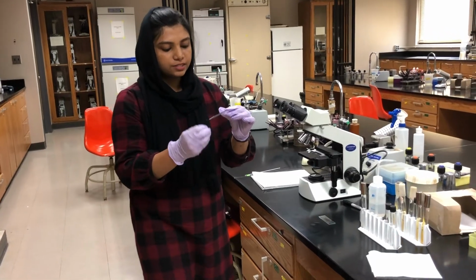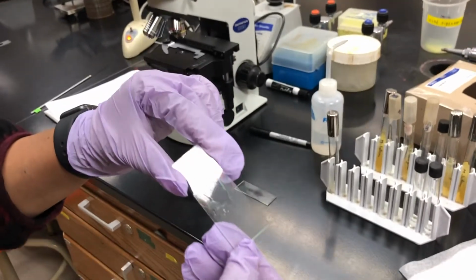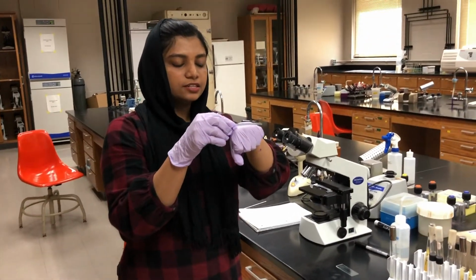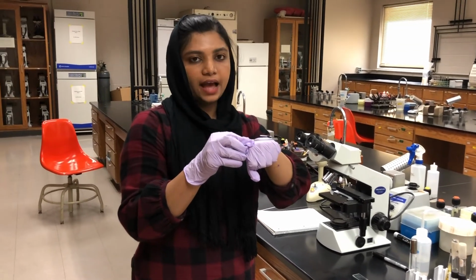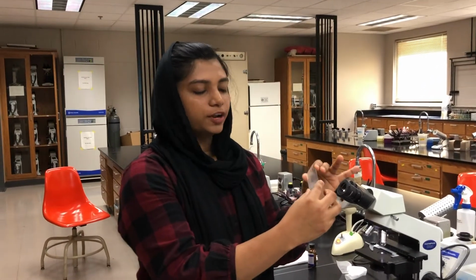And now you guys could see the slide, it's still not air dried. For easy air drying, you could place the slide on your hand, so the temperature from your hand can make it dry more easily, and after drying you could add the stain. Now the slide is air dried. Now I'm going to heat fix this.